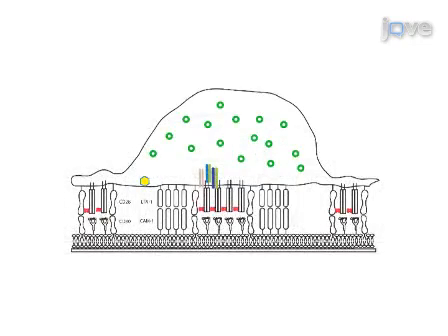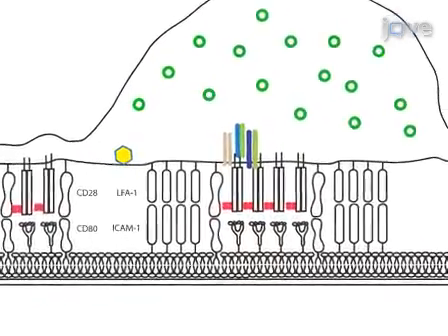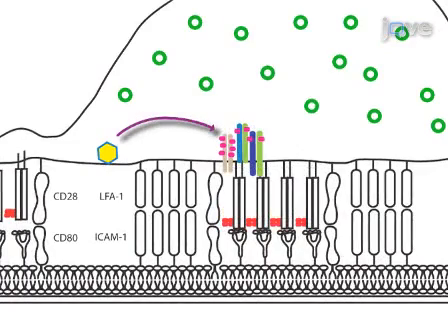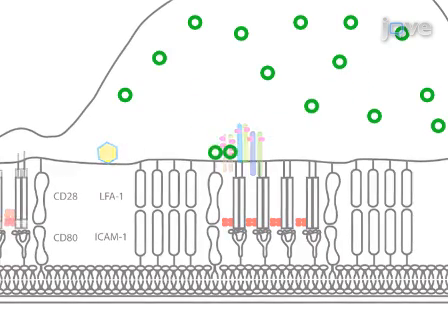When the T-cell receptors are engaged by peptide MHC complexes, the T-cell receptor-associated CD3 chains are phosphorylated by the Src family kinase LCK, and the kinase ZAP70 is recruited from the cytoplasm.